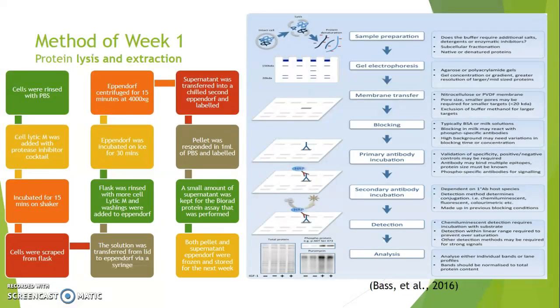It is used as a stain during the reversible staining of transferred proteins and for the qualitative visualization of proteins on the PVDF membrane during immunoblotting. What is the difference between PVDF and nitrocellulose, or when should you use them? Both are used during Western blotting. However, nitrocellulose is ideal for detecting low molecular weight proteins, while PVDF is more suitable for detecting higher molecular weight proteins. Why is it necessary to normalize protein content?